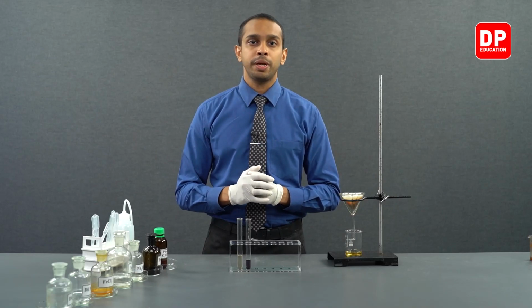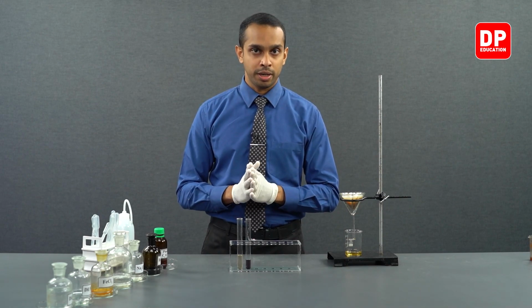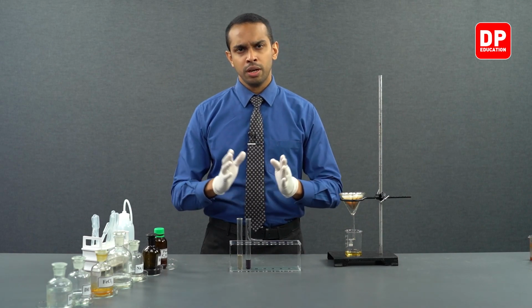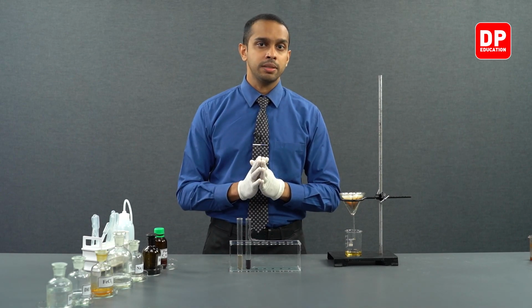In summary, in this part of our experiment, we initially started with observing the properties of ferric chloride salt. We observed that the ferric chloride salt is an acidic salt. After checking the pH of the ferric chloride solution that we have, we decided we need to obtain a neutral ferric chloride solution. And we prepared a neutral ferric chloride solution by adding ammonium hydroxide or dilute ammonia until we obtained a brown color precipitate.